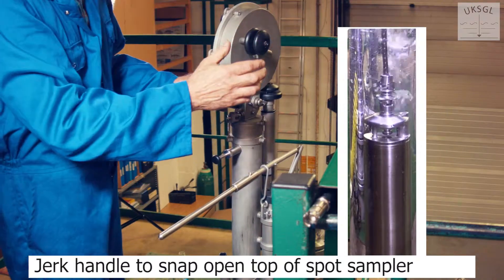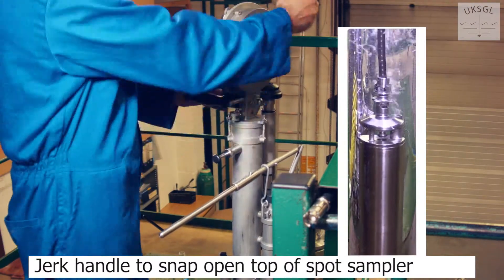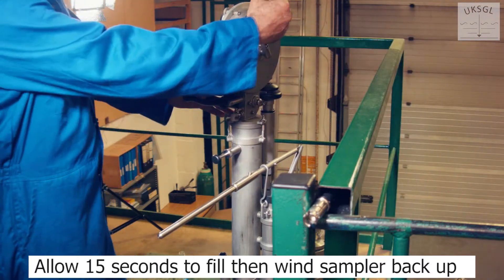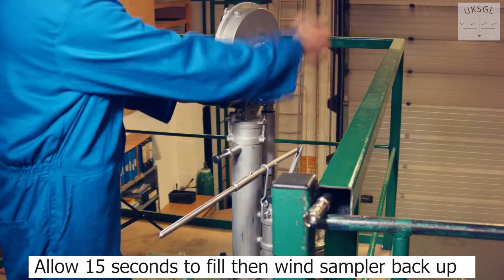At the required depth, give the winding handle a jerk to snap open the top of the sampler. Allow 15 seconds for it to fill, then wind the sampler back up.